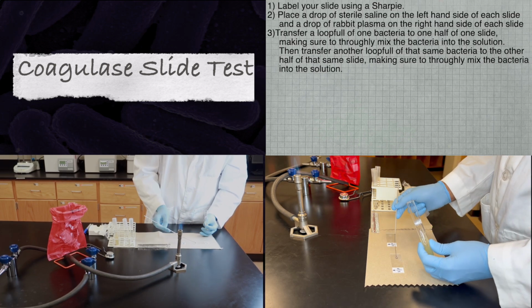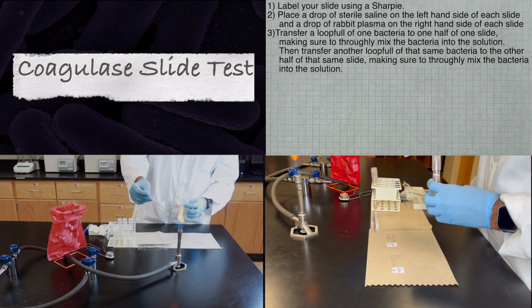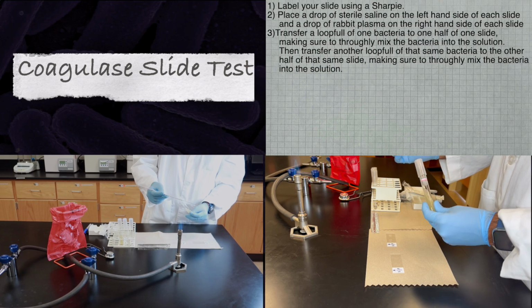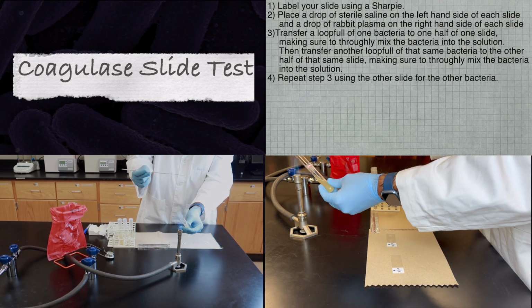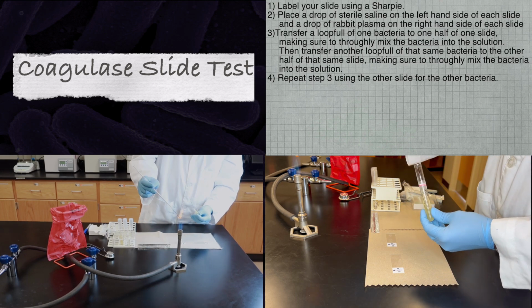Then, transfer another loopful of that same bacteria to the other half of the same slide, making sure to thoroughly mix the bacteria into the solution. Please repeat this step 3 using the other slide for the other bacteria.